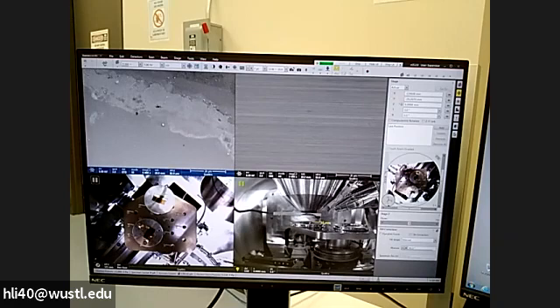For this sample, we see here we have a little bit of clip. The clip screw is a little bit higher. When we drive, we still need to be careful. Because it's 10 millimeters away from the lens, we don't have to worry here. But if you happen to drive very close, you need to make sure you move down the stage before you drive horizontally. Okay, so today we don't have an issue here.